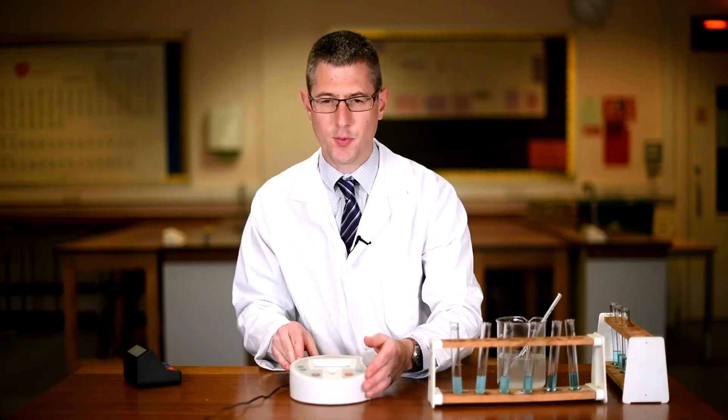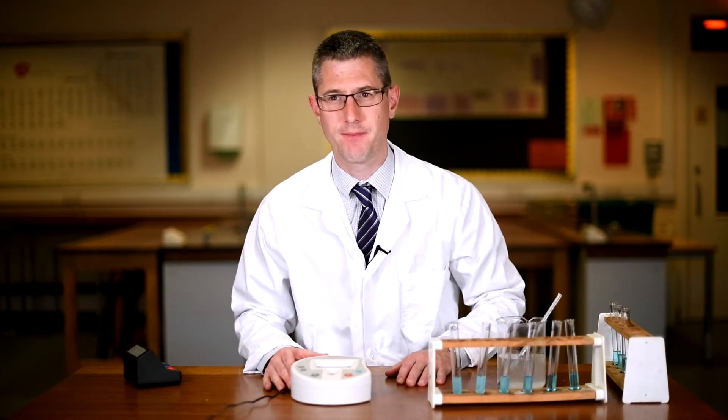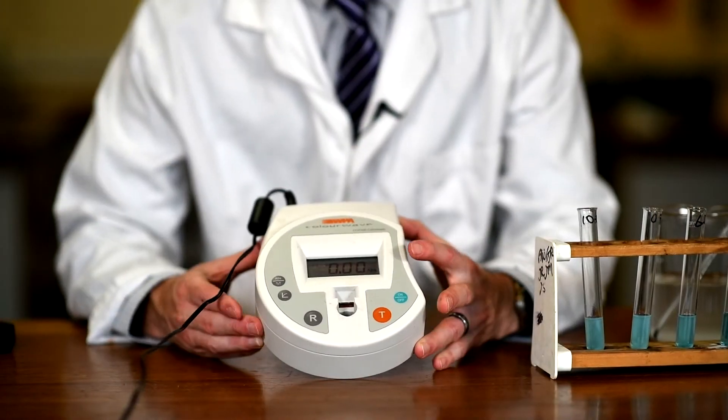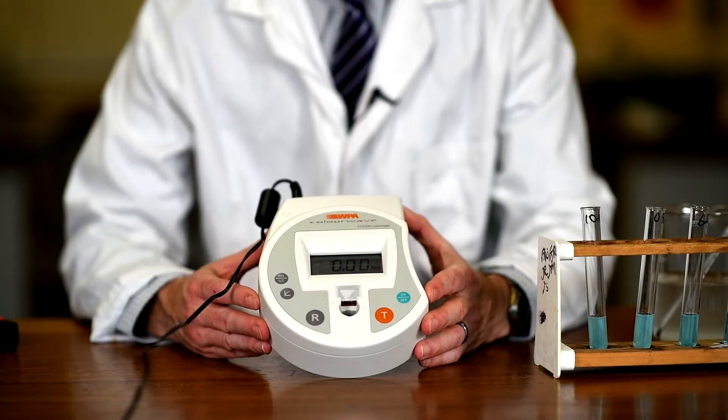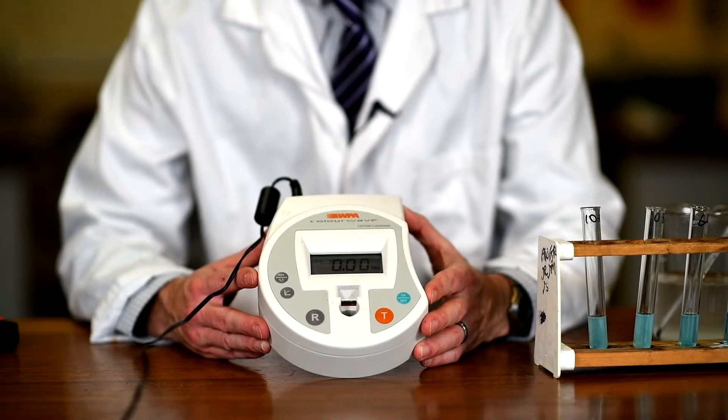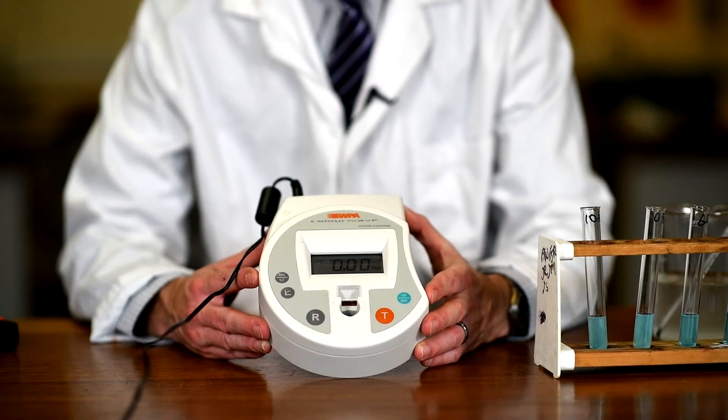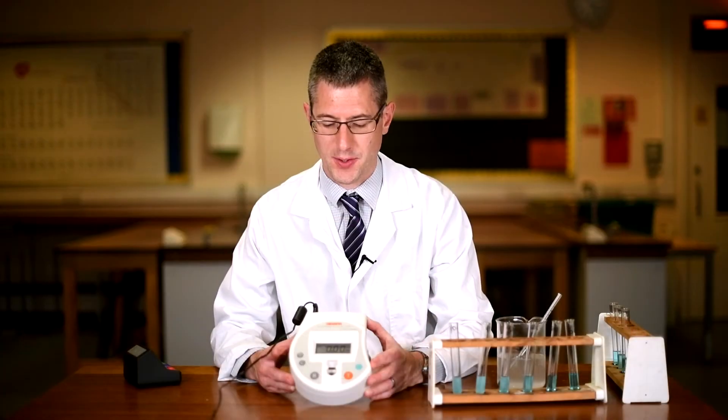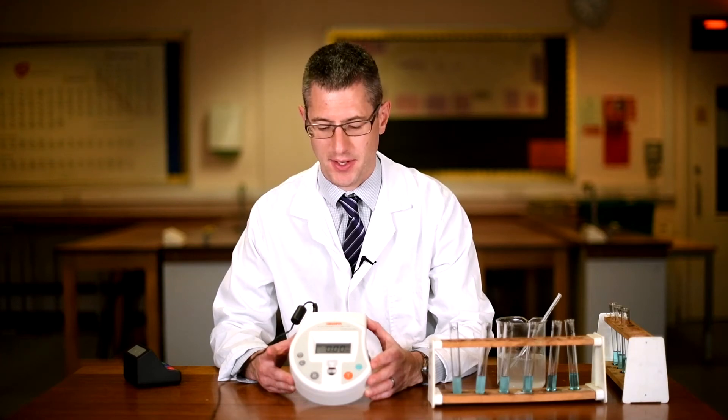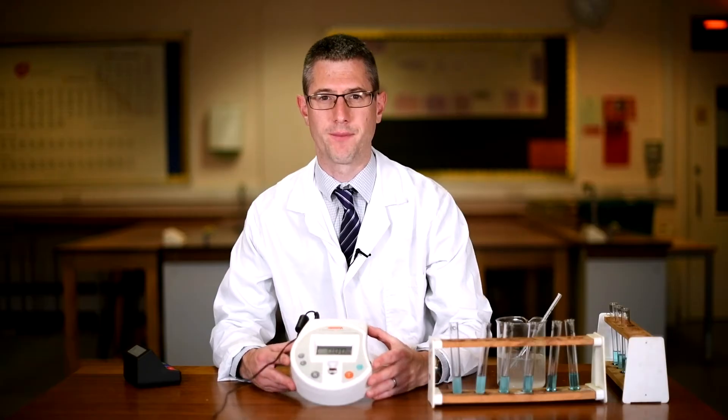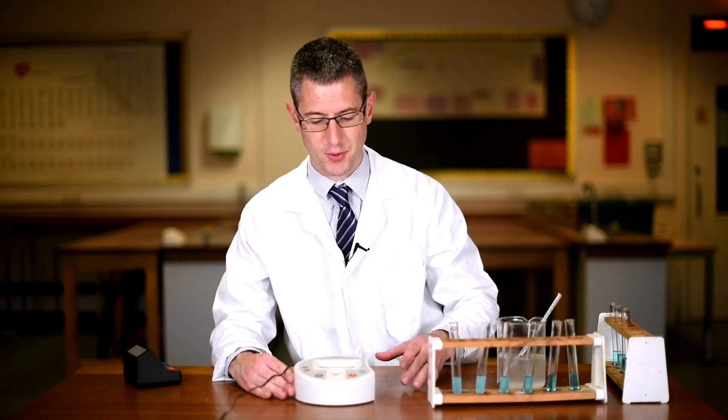We've got here our colorimeter. This is one where you can directly put a test tube in and measure the absorbance of light. So you might see the setting is on absorbance. So we're measuring the absorbance of light by the samples in the test tube. So how much light can pass through the sample and how much light is actually being absorbed, scattered by the sample, so it's not reaching the detector in the colorimeter, giving us a number readout, a quantitative data readout of how cloudy these samples are.